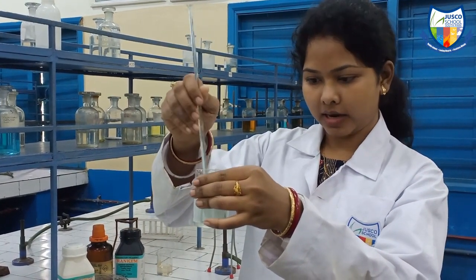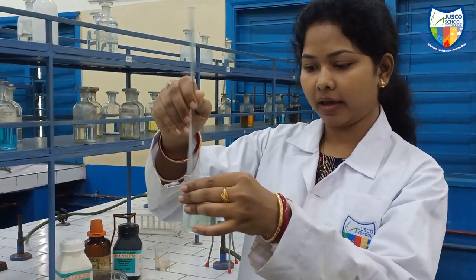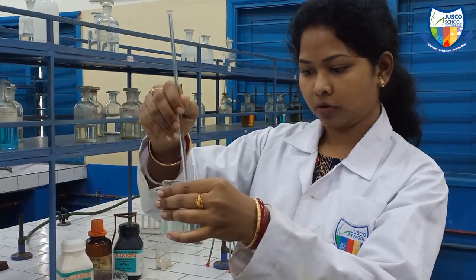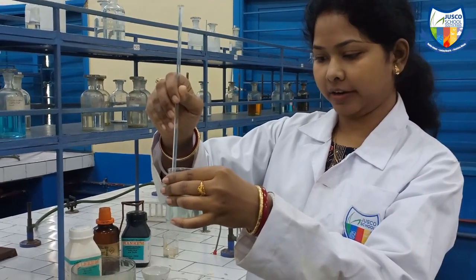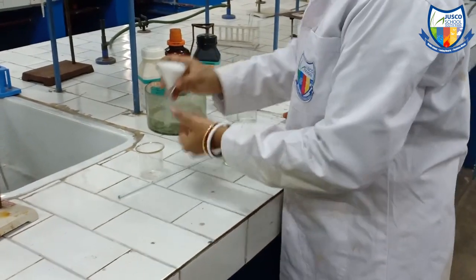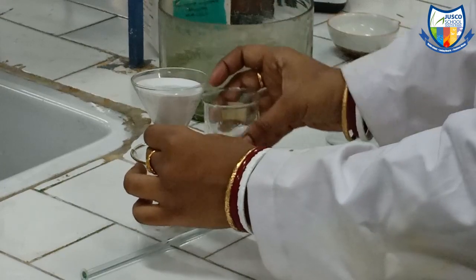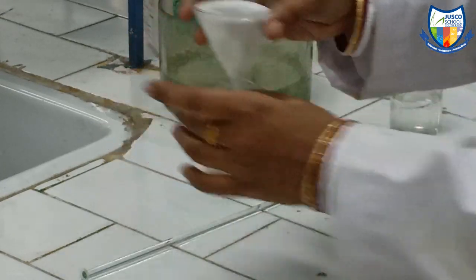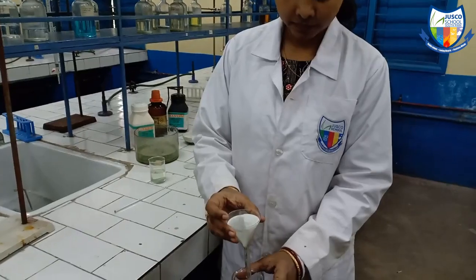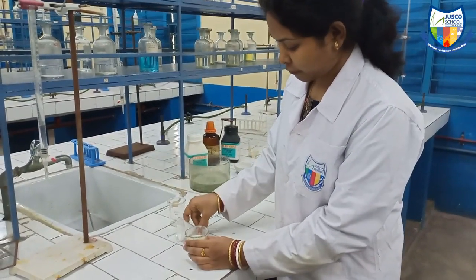Now, to check whether some particles are left or there are some impurities, we will take a filter paper and filter it. If there are any impurities they will be filtered out. As you can see, I am filtering the solution now.